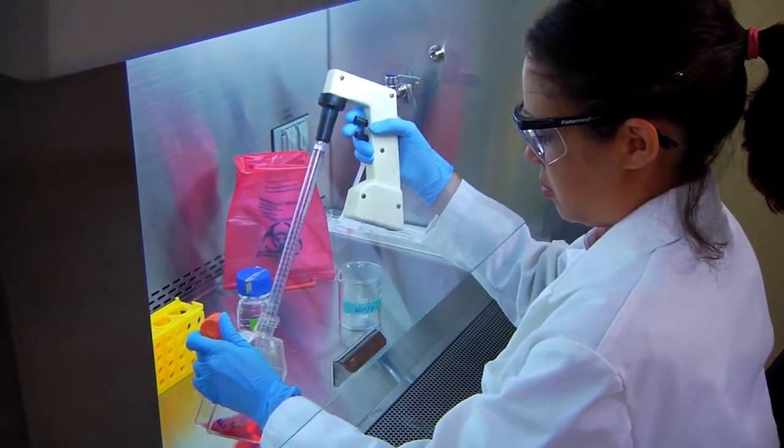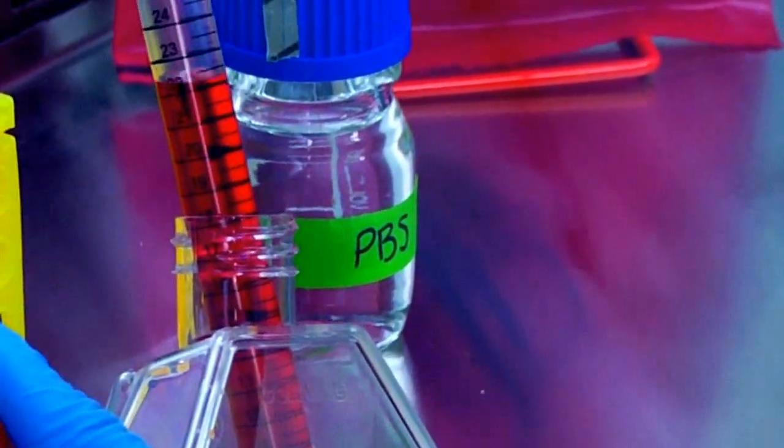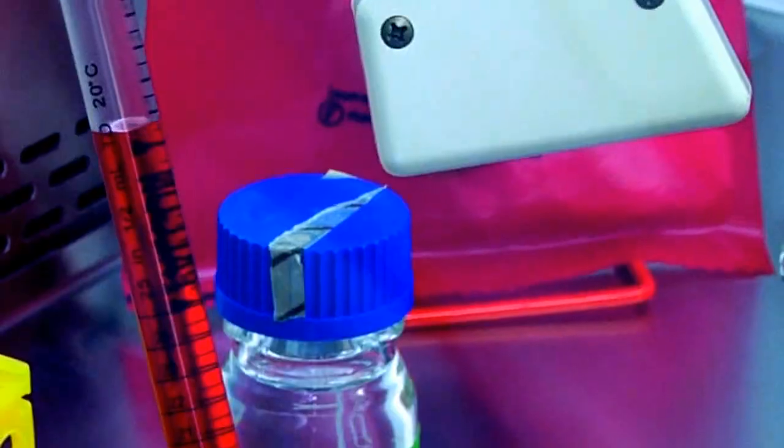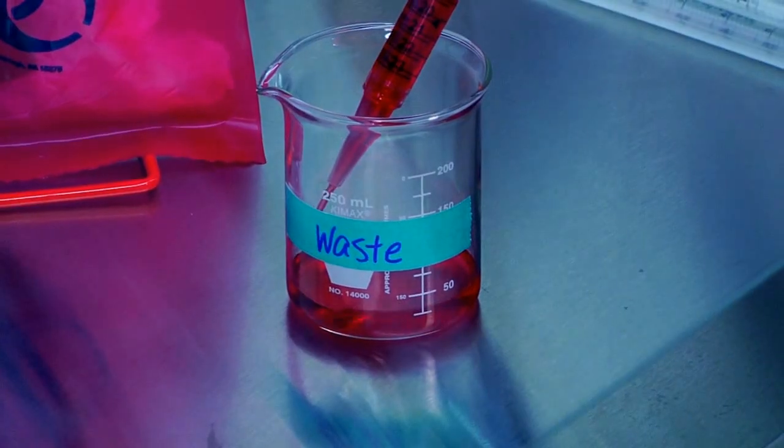Under the vertical flow hood, remove and discard the culture medium into a waste beaker that contains approximately 100 milliliters of bleach. The bleach is used to kill any cells or microbes that are left over.